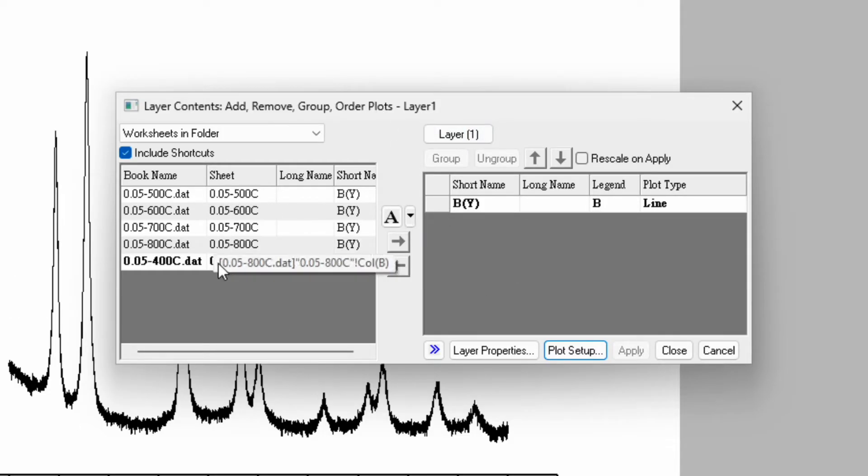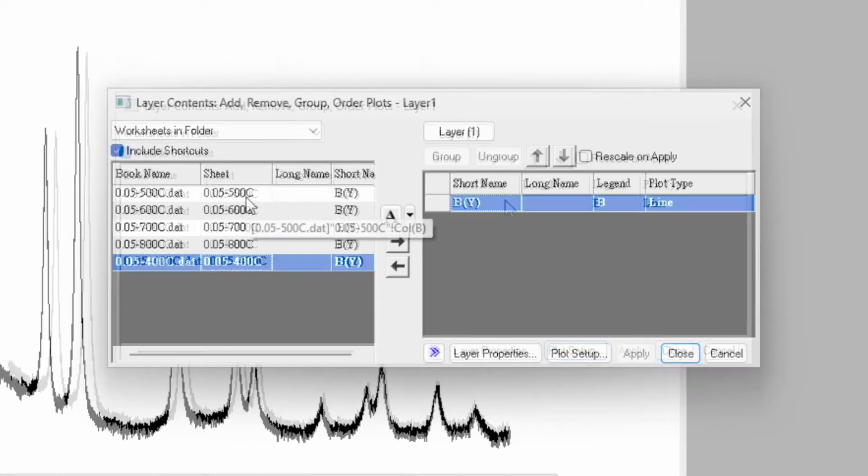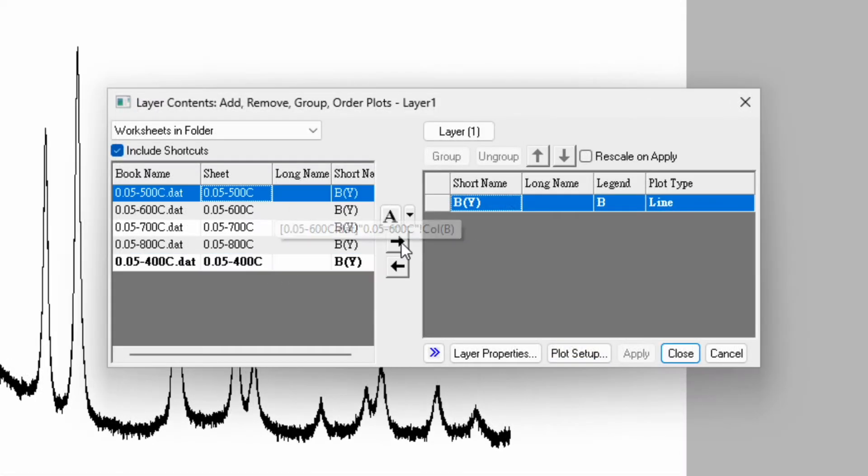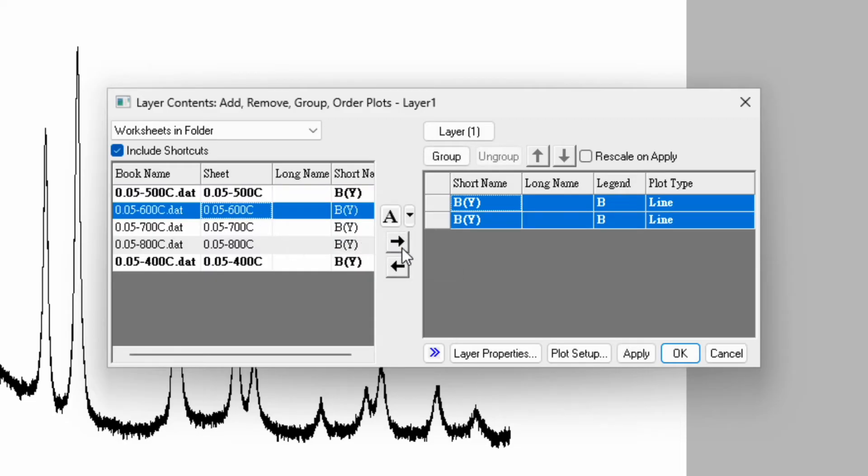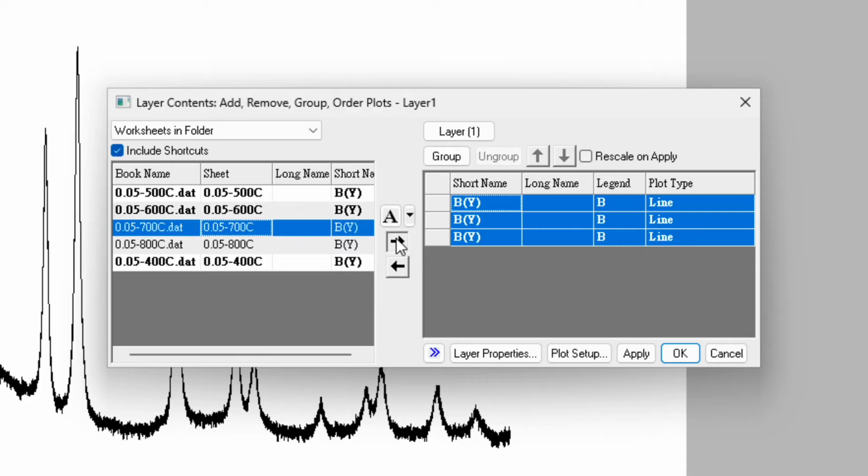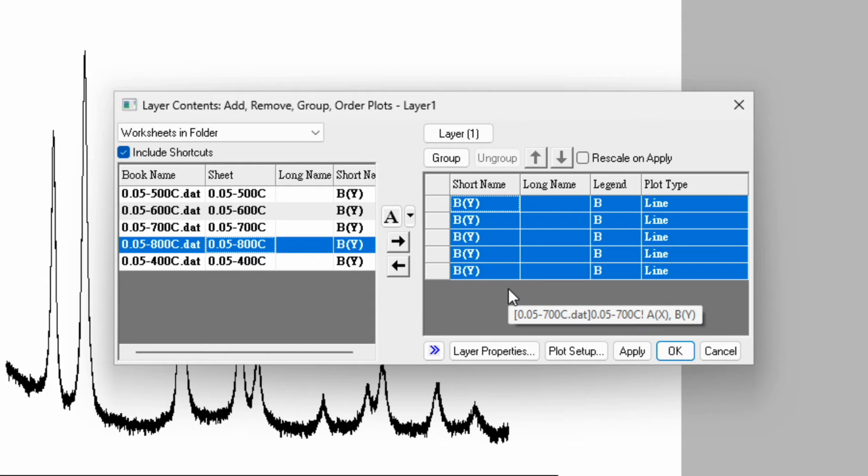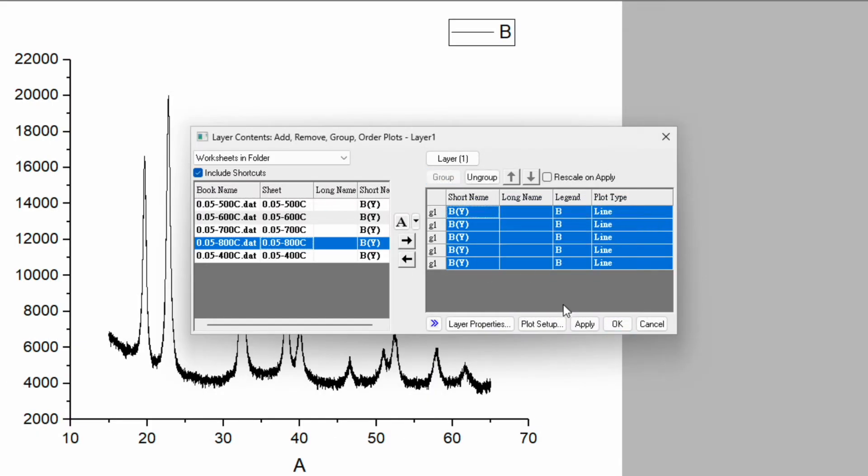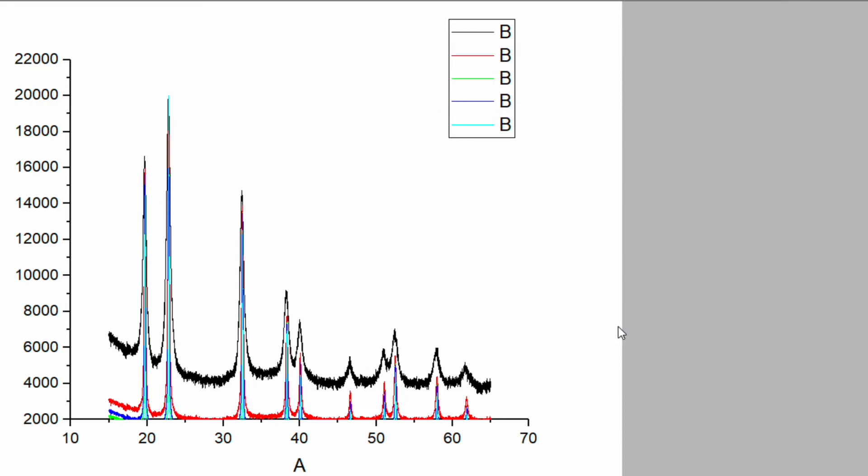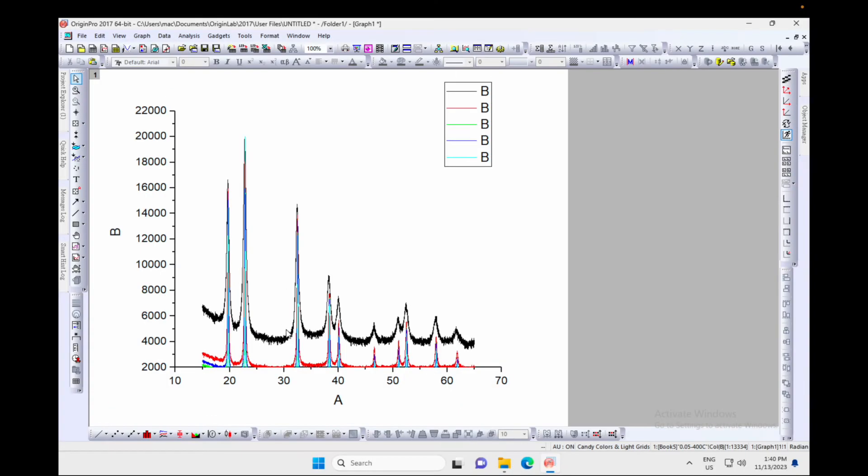This is layer one with the data in the project folder. Add the second file at 500 by clicking the arrow pointing right. Do the same for 600, 700, and 800. Now all data files are in layer one. Select them, group it, and click OK. All data now plots in the same figure.